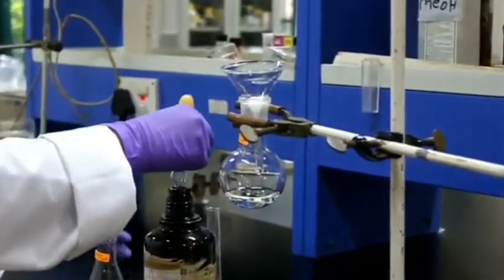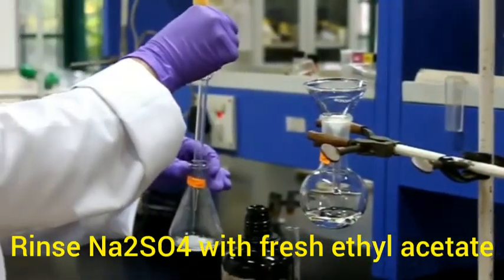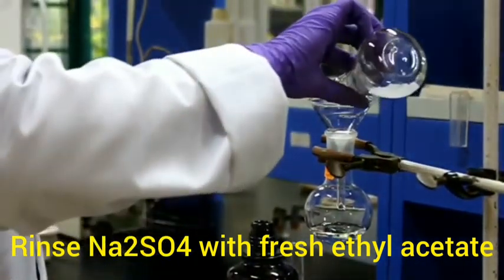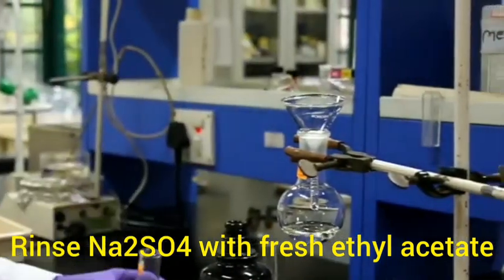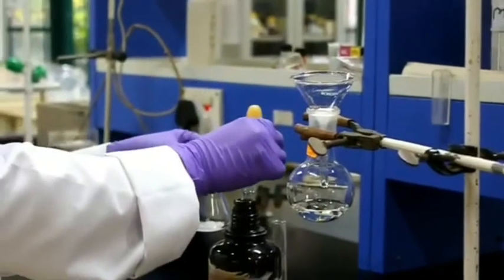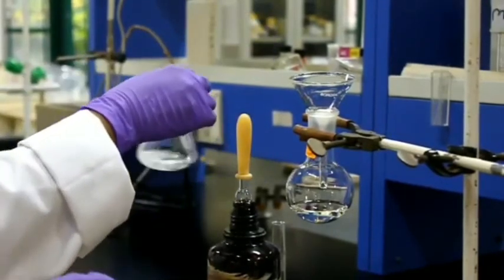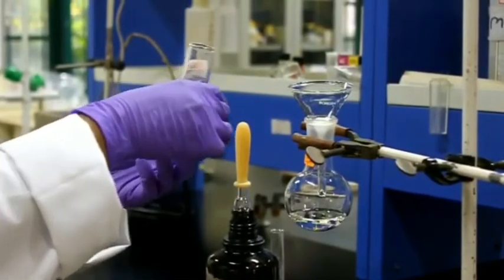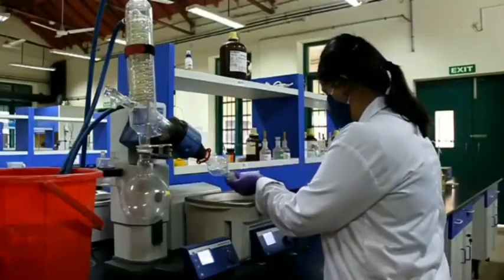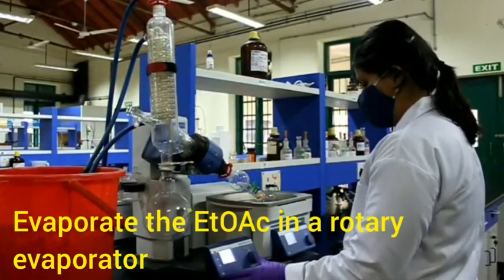Now we are rinsing the sodium sulfate with fresh ethyl acetate. We are rinsing again. We should do the rinsing 2-3 times. Now we are evaporating the organic solvent in a rotary evaporator to get the crude product.